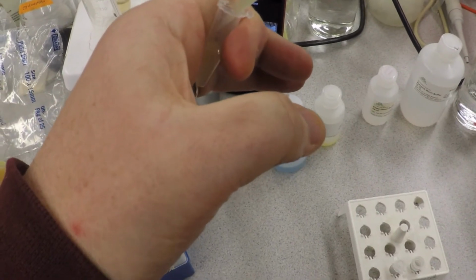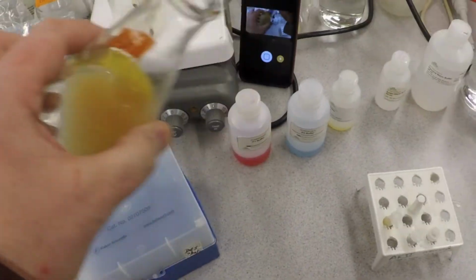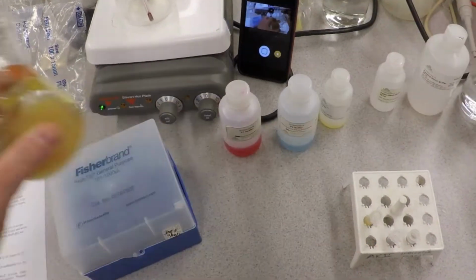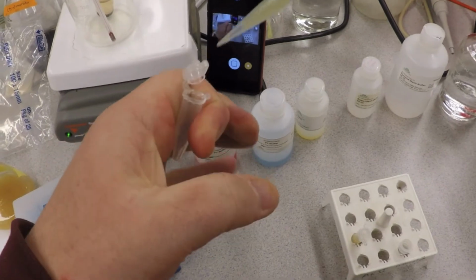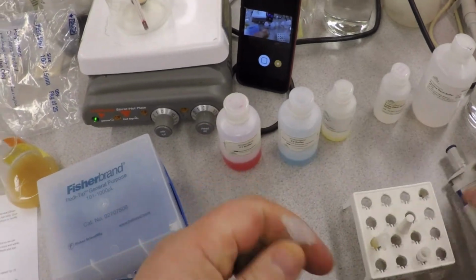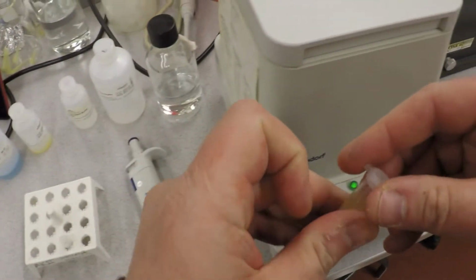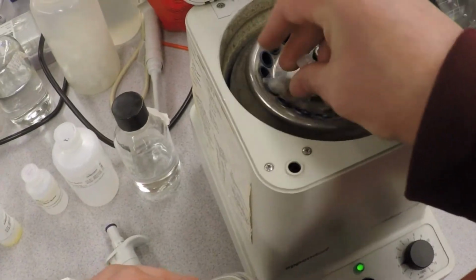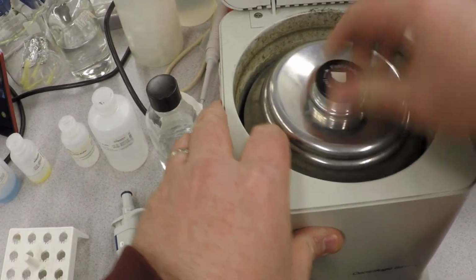And because I'm doing this by myself, I'm going to do this twice because I want to have a balance. And you can do the same if you'd like to balance your tubes. Well, not like to, you have to. So I'm doing this twice. Okay. Got our little cells. So we're just going to come over here, pop it in the centrifuge. Make sure you put them on opposite sides, like usual. Put your top back on, however that fits.